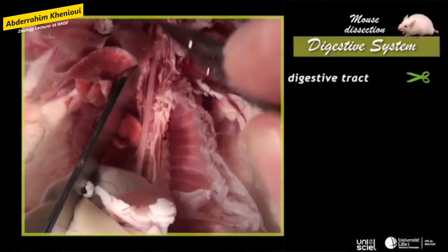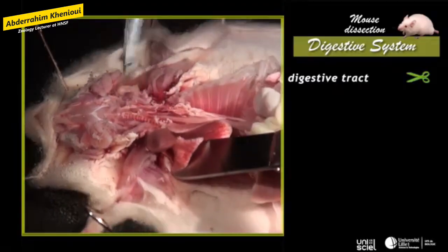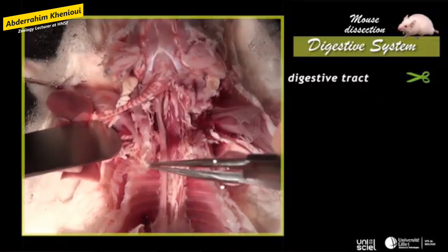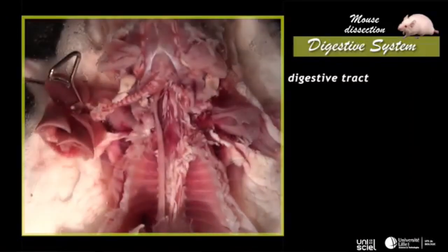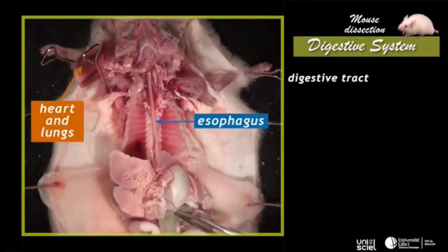These tissues must be removed with the help of forceps going up along the esophagus while holding the heart and lungs apart on the left. The heart and lungs are pinned. The esophagus is now visible in its whole length. It meets the stomach in the abdominal portion.